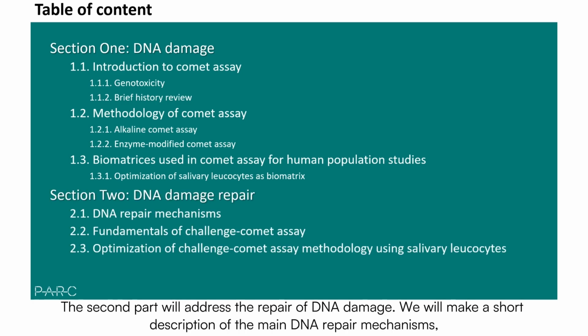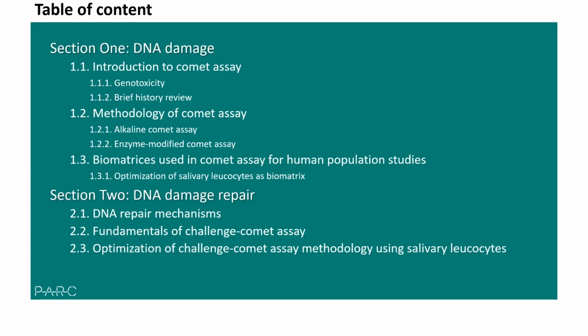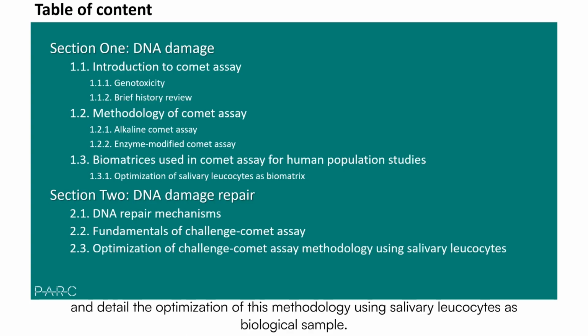The second part will address the repair of DNA damage. We will make a short description of the main DNA repair mechanisms, describe the fundamentals of the challenge-comet assay as a functional assay for evaluating the DNA repair process, and detail the optimization of this methodology using salivary leucocytes as biological sample.